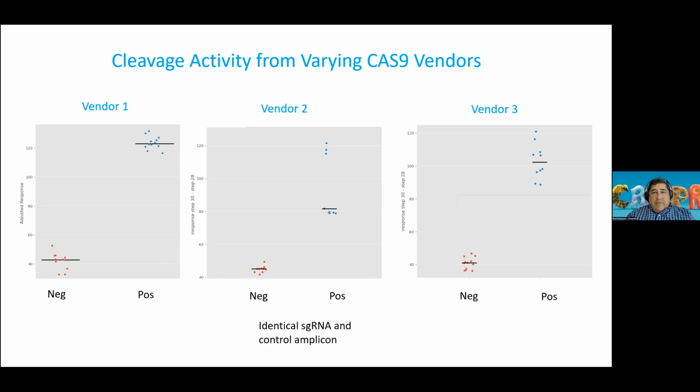So we do a lot of this very, very simple analysis for customers now, which is quite rewarding, to be honest with you. And it's a very simple experiment to do. It doesn't take long. It's just the first third of that assay that I showed you. And so we do advertise this and now provide this service to a number of companies.